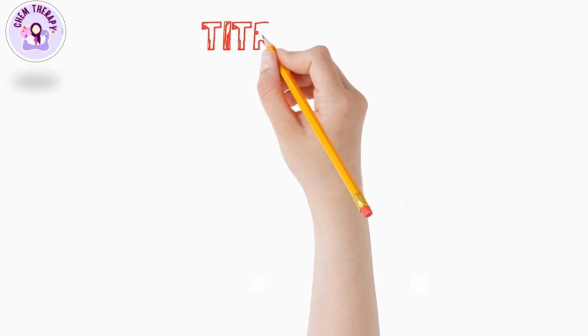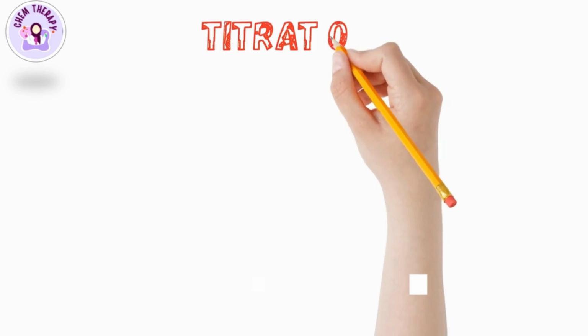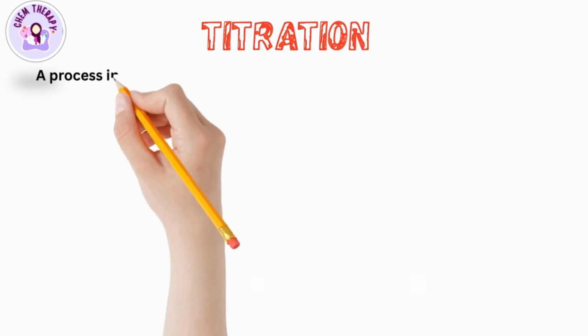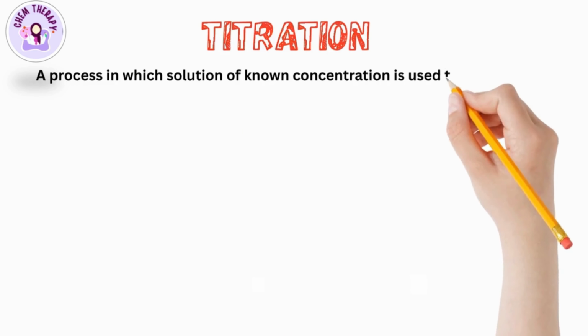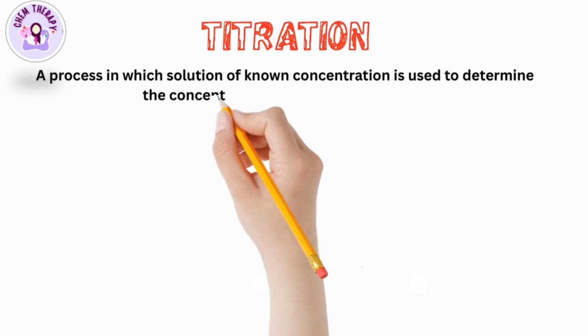In this video, we will learn about the titration process. It is the process in which a solution of known concentration is used to determine the concentration of an unknown solution, volumetrically.